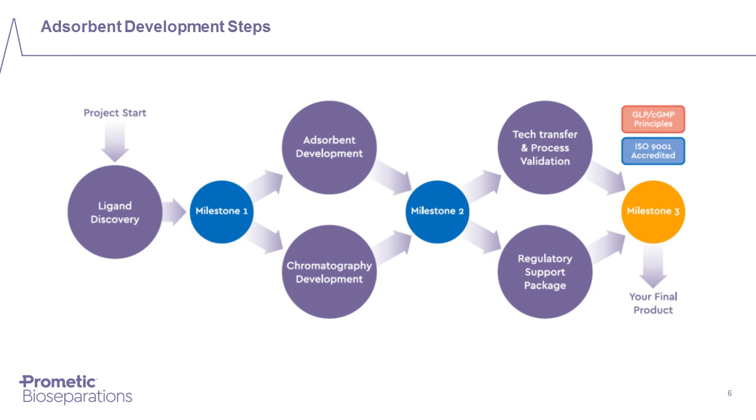But in general, just to give you an idea of what the process of developing an adsorbent for affinity chromatography from scratch looks like, this is summarizing this figure that you can see now. So we start with the ligand discovery step, and I'll give more details on each one of the steps in a minute, but just in general. We start with a ligand discovery, which typically prompts a milestone.